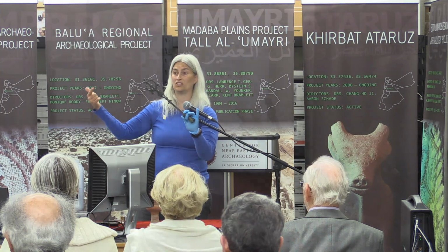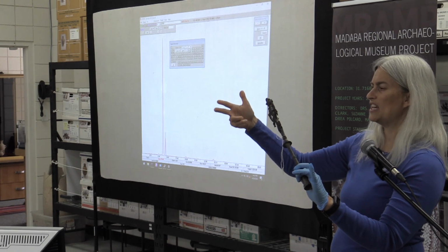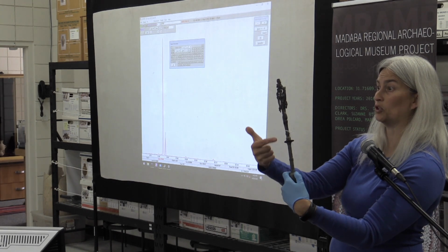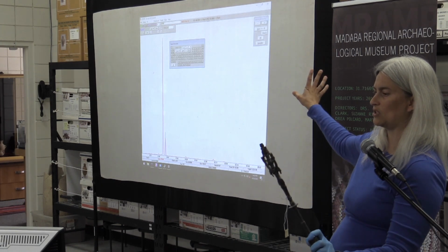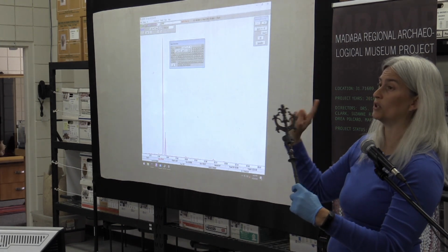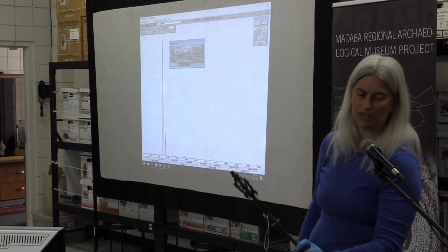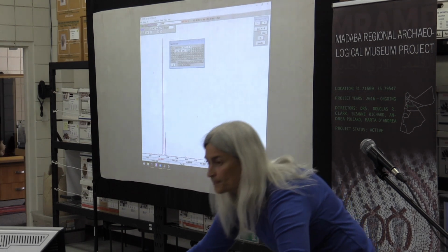As it gets older, it turns, I heard it faintly, green and blue, right? And then it sort of peters off. If you're really close up here, you can see there is some blue green here, but most of it is that dark color. So this helps us understand that yes, it is mostly copper. Not just kind of copper, but really very, very much copper. Now, most of the time, copper does have something else with it. So if we look at our very small peaks, we can see what those are.